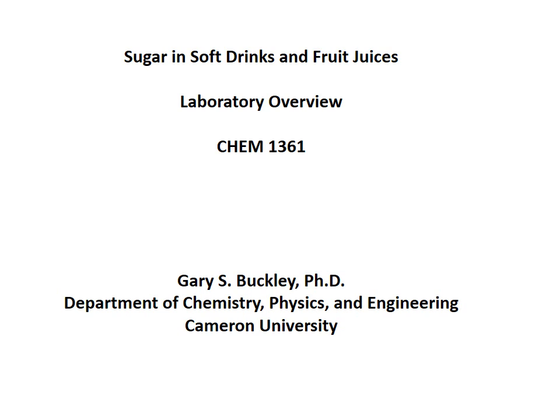This will be a brief introduction to the sugar and soft drinks lab that you'll be doing coming up pretty soon. Basically in this lab what you'll be doing is taking a look at measuring the percent sugar that you have in soft drinks using two methods, both density and using a hydrometer as a means of measuring density.